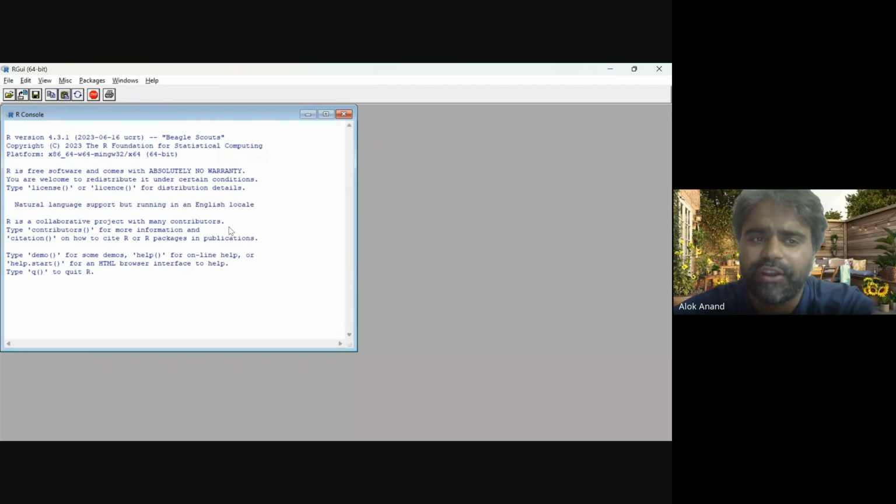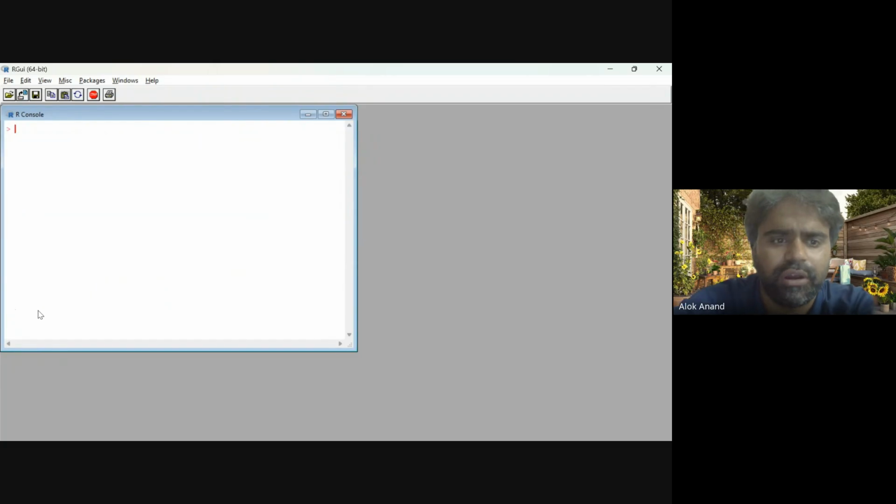So let us first understand this. This is called the R console, guys. Here you'll be able to do whatever analysis you want to do. You can see it is written here, R console. So let us do a few things. Suppose I want to do some arithmetic.